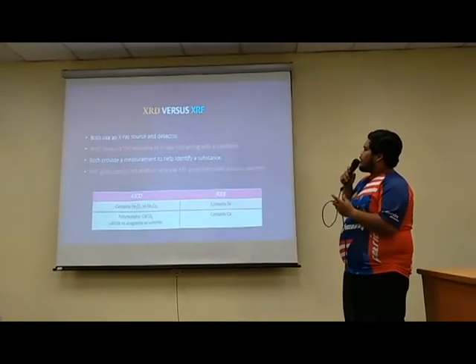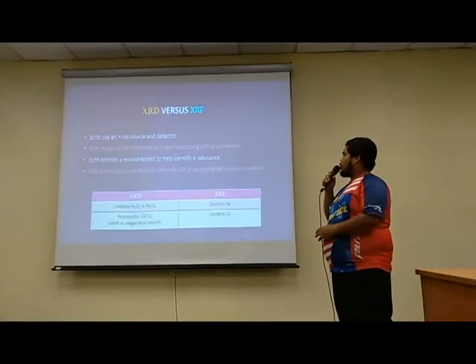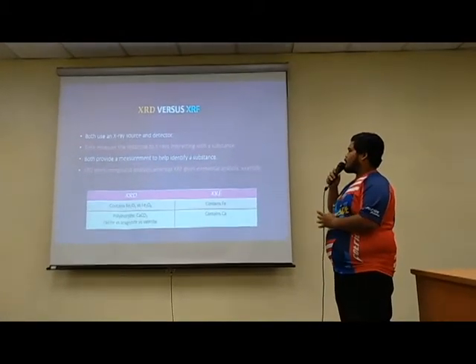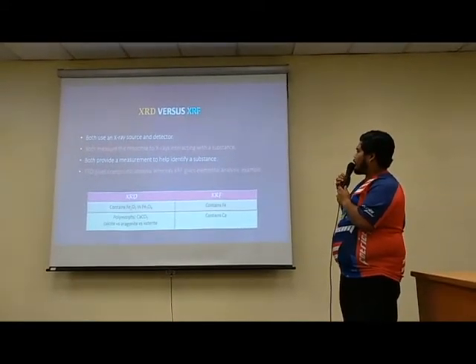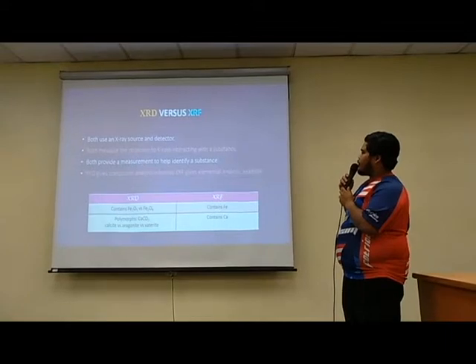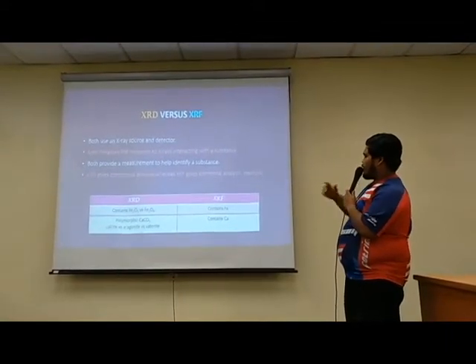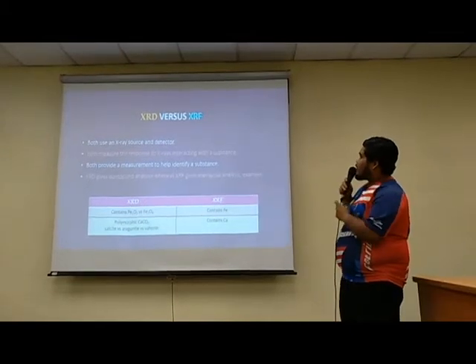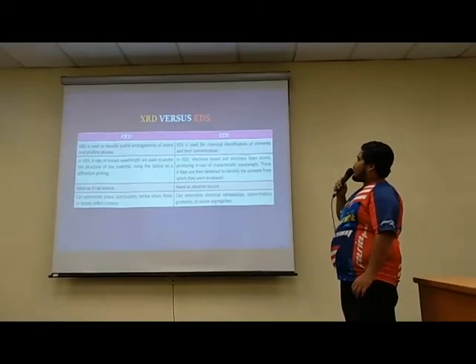Both techniques use an energy source and also a detector. Both measure the response to the substance reacting with the energy, and both provide measurements to help identify the substance. XRD gives compound analysis, whereas XRF gives elemental analysis. So this one is the example. Okay, next. This is XRD versus EDS.